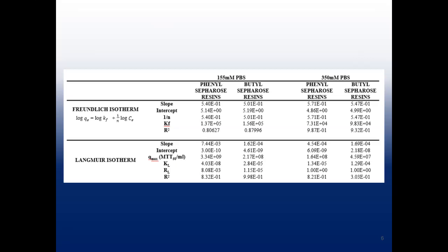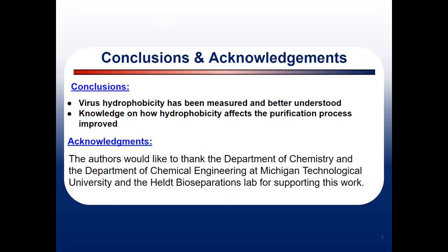A Freundlich best fit tells us that the surface of the hydrophobic resins is non-homogeneous. These graphs show that PPV is hydrophobic because the adsorption isotherm graph showed a sloped line. This slope means the virus was bound to the resins, which only occurs if the virus is hydrophobic. Therefore, the hydrophobicity of PPV was analyzed using adsorption isotherms.